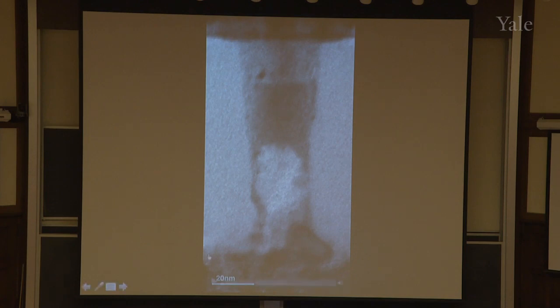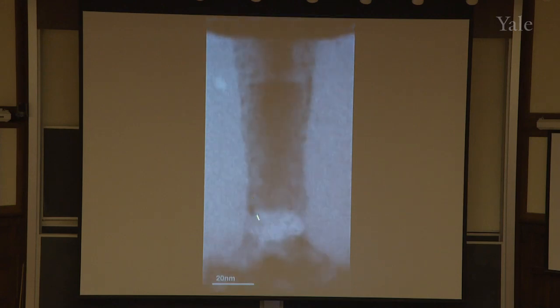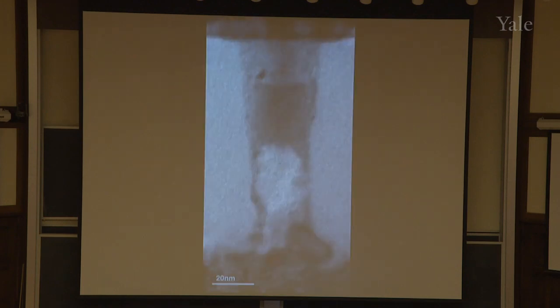And indeed, knowing how important antimony movement is, he put negative voltage down here and kept pulsing the negative voltage until all the element flows and fills the entire device, which is kind of interesting. So you can see that the material is moving, and then at one point it fills the entire device.